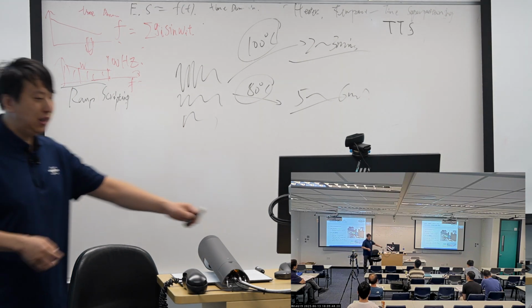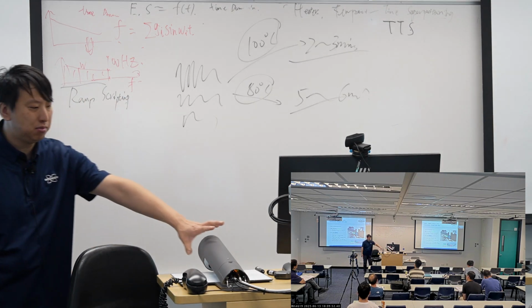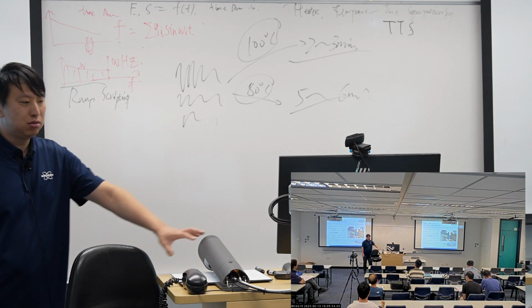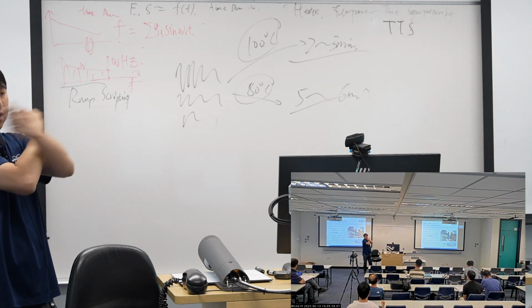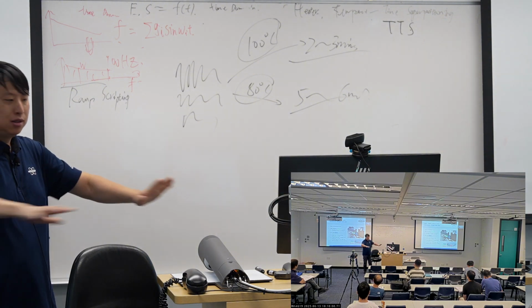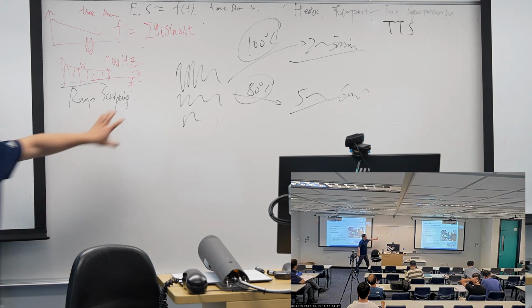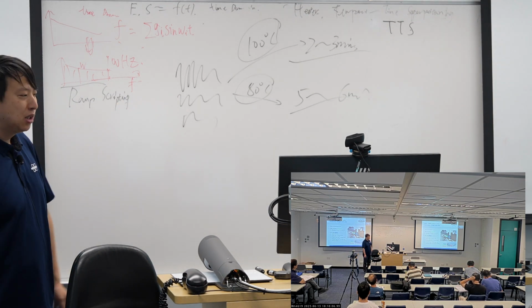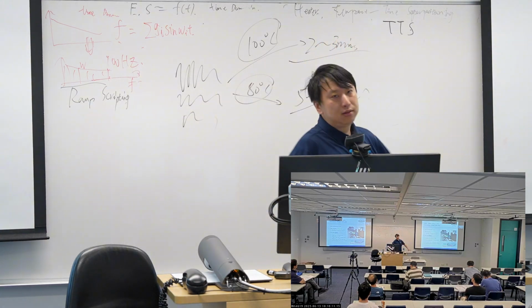The polymer inside quite plastic, quite hard materials is just polymer chains tangled together quite tightly. If you heat it, it will melt down the molecular chains, they will loosen and release, just like our instant noodles. So the game is the same for the TTS.